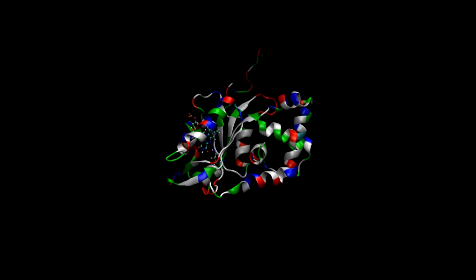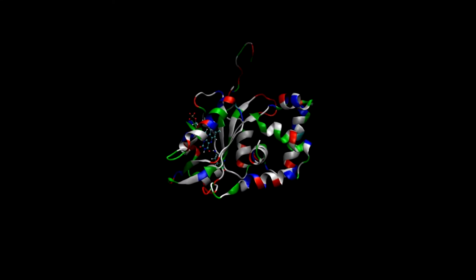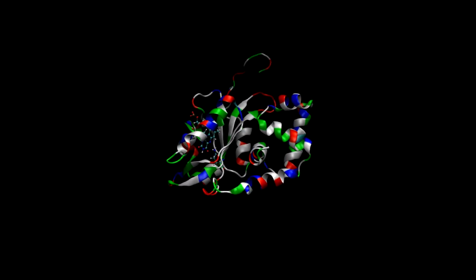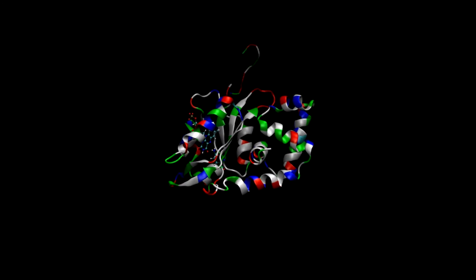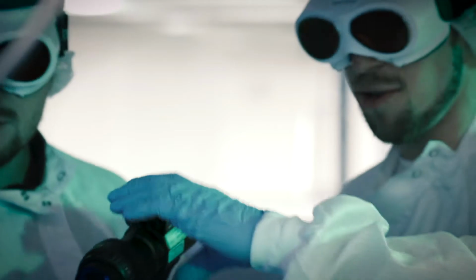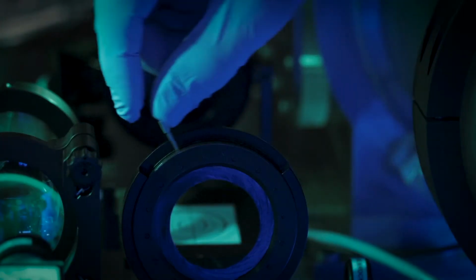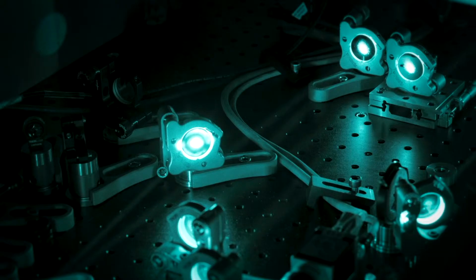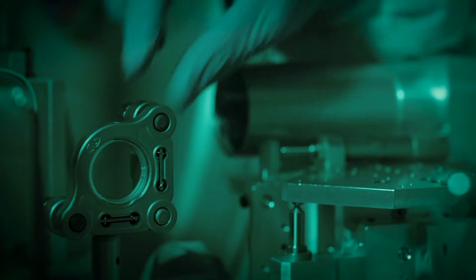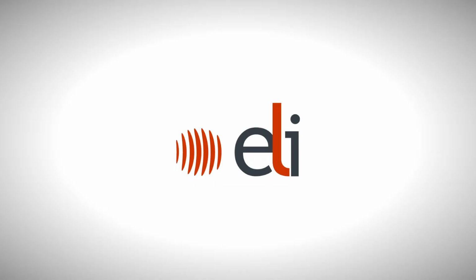And last but not least, we study dynamic, time-variable aspects of interactions between proteins and DNA. In our laboratory, we devote great attention to this research. Thanks to our collaboration with the Institute of Physics of the CAS, the ELI Beamlines laser facility, we can study the dynamics and interactions of potentially technologically interesting transcription factors, meaning proteins controlling the synthesis of other proteins in cells.